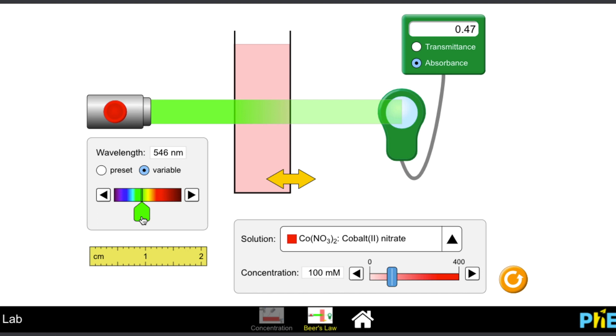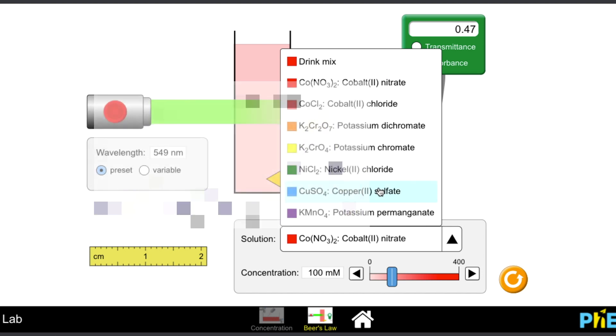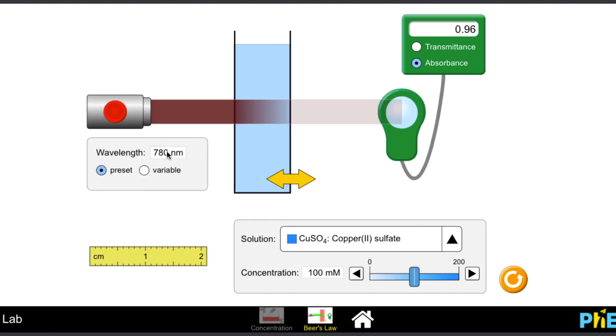For a given solution, you need to find the wavelength of maximum absorbance. Here in the PhET simulator, the preset is 549 nanometers for a red solution. However, if you were to go to a blue solution, the preset is 780. So let's go back to the 549 that we used on the red solution and see what it is like. The absorbance is very low. So what works for one solution will not work for the other.